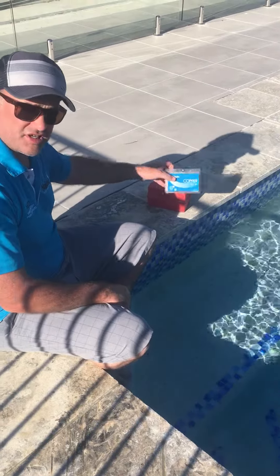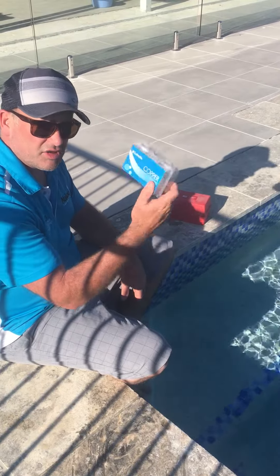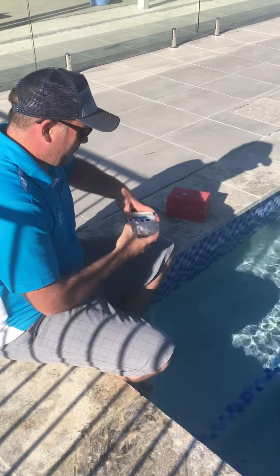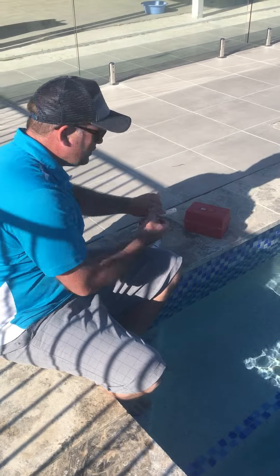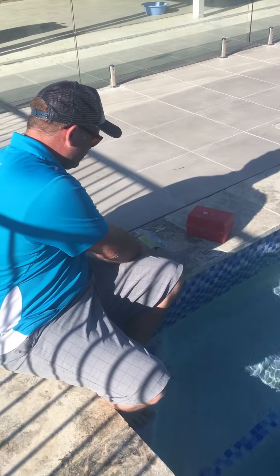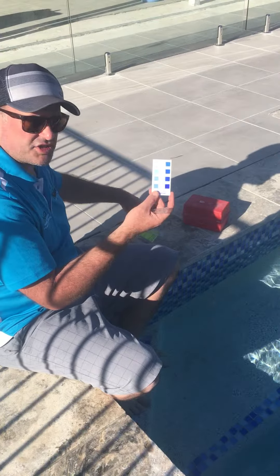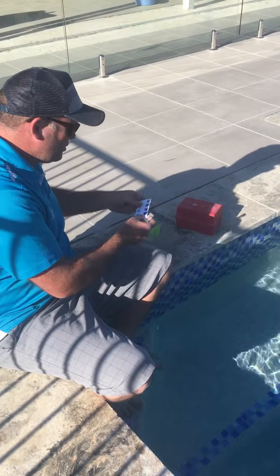Now I'm going to show you how to do a copper test. With every fresh Naked Freshwater system, you get a copper test in the box. Just open it up and you've got a vial, solution A, solution B, a color chart, and the instructions are on the inside. It's very straightforward.